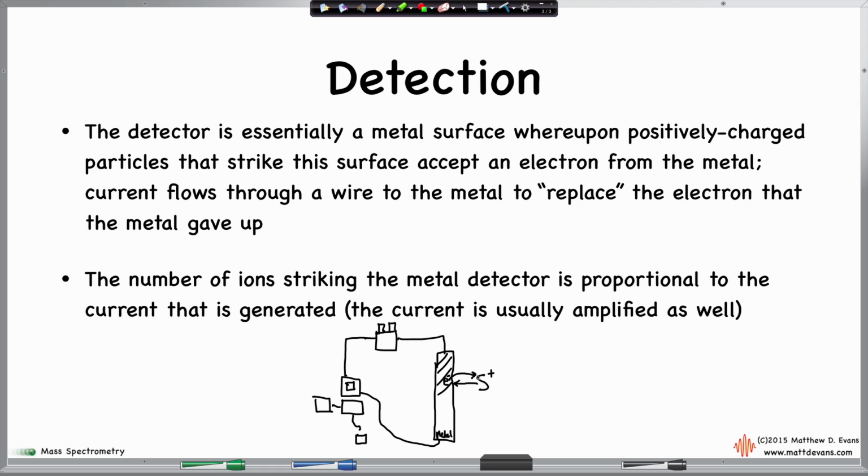This compound eventually gets sucked out of the chamber. Now, as soon as that electron is lost, there's a power supply that's providing more electrons. And so really what we get at that point is as soon as we lose this, we get a current flow, okay? And that current flow is something we can actually quantify on the computer, and that's essentially what we're measuring is current.